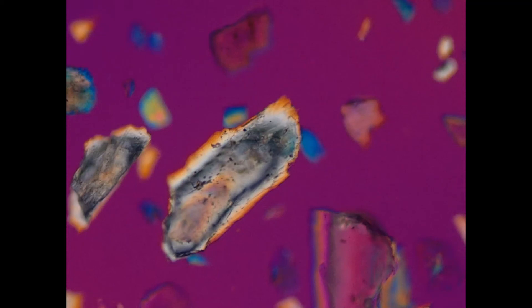Putting these observations together, the reddish pleochroism, the black impurities, the parallel extinction and the negative elongation, we can conclude that this must be an andalusite grain. Thanks.